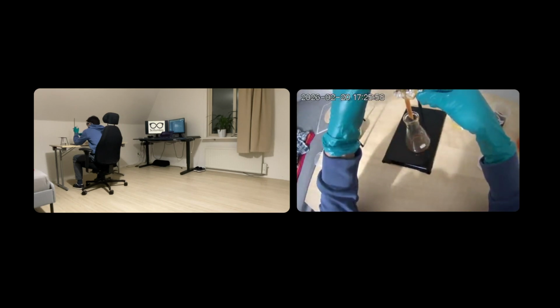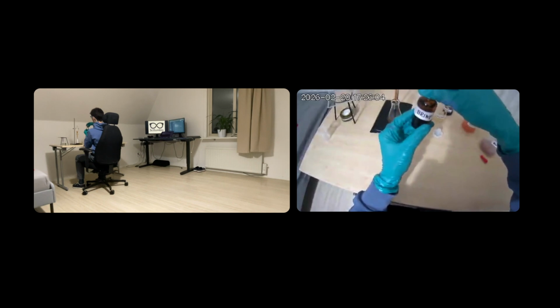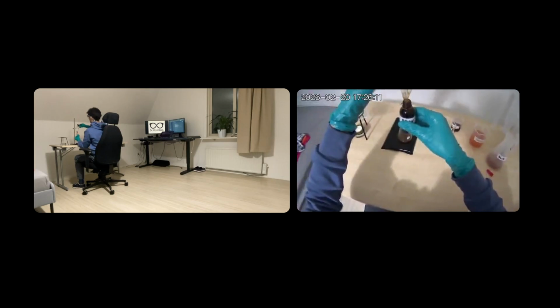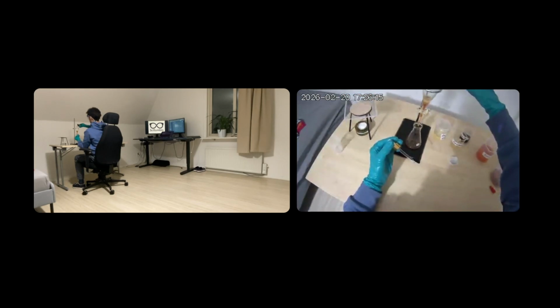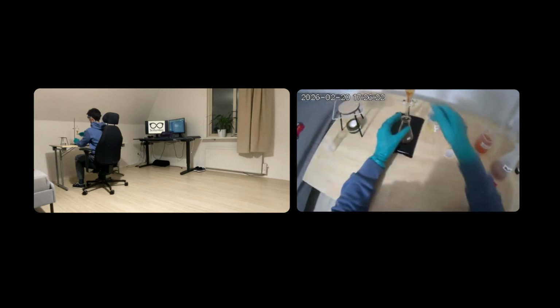To make sure that we can separate it even nicer, we can add some brine solution to it, which is a saturated sodium chloride solution.